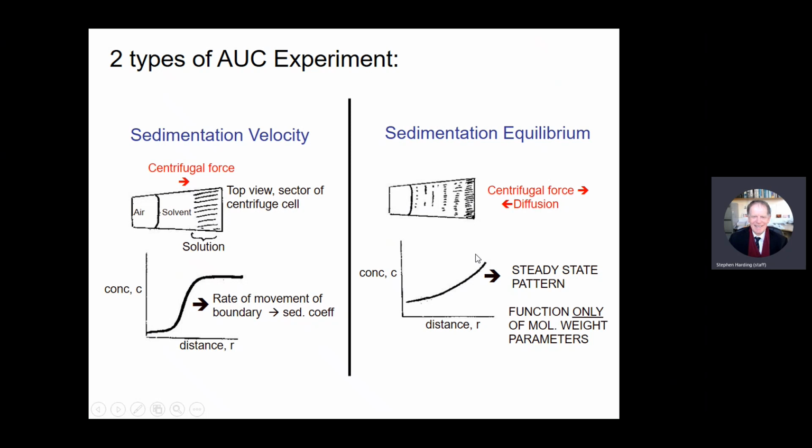When the forces have sorted themselves out, that's how it happens. It doesn't band. You don't get a band. You only get bands if you use what's called a density gradient sedimentation procedure, or use cesium chloride density gradients. But in a straight solution, you just get a low concentration building up to a high concentration at the bottom.